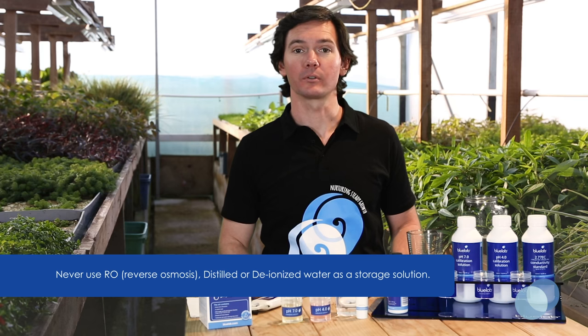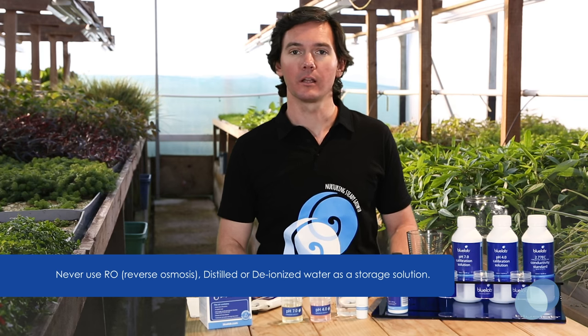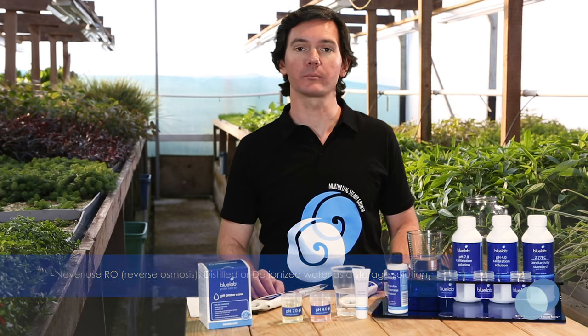Remember never to store your probes in reverse osmosis or RO, distilled or deionized water. These types of pure water can change the chemistry of the probe glass and cause damage to your probe.